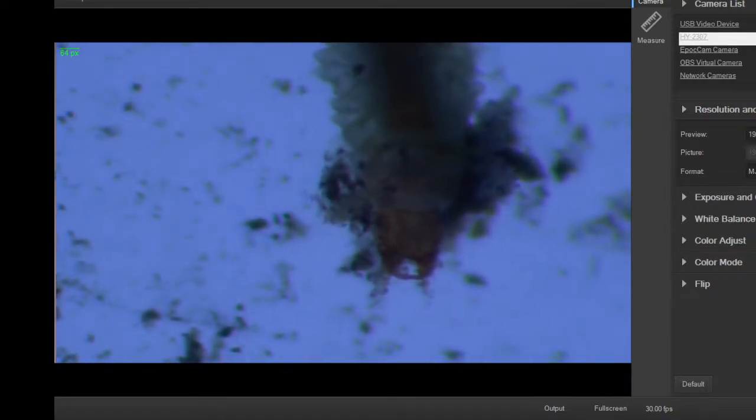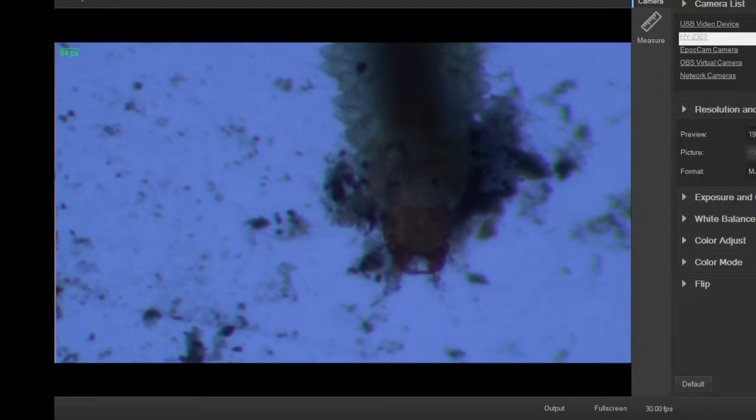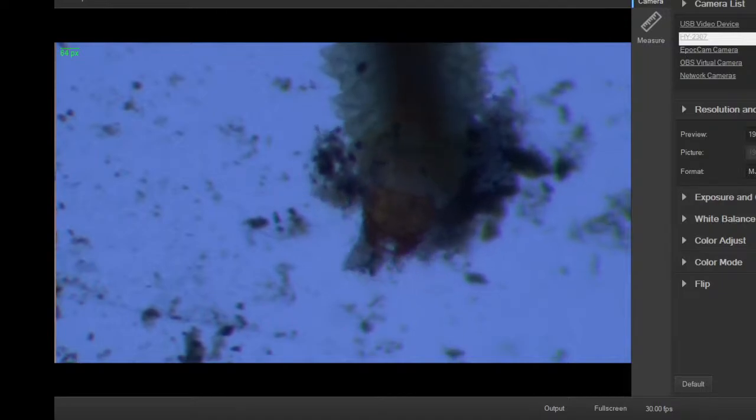Quite a few insects, and now depending on where this is collected, it could have been on some leaves, could have been in the water, or a combination of the, maybe the soil nearby. I did kind of a wide sample on this particular collection. But there are quite a few insects that have an aquatic larval stage, or nymph stage. So, even though it kind of looks like a head of a pincher bug, not sure what it is.